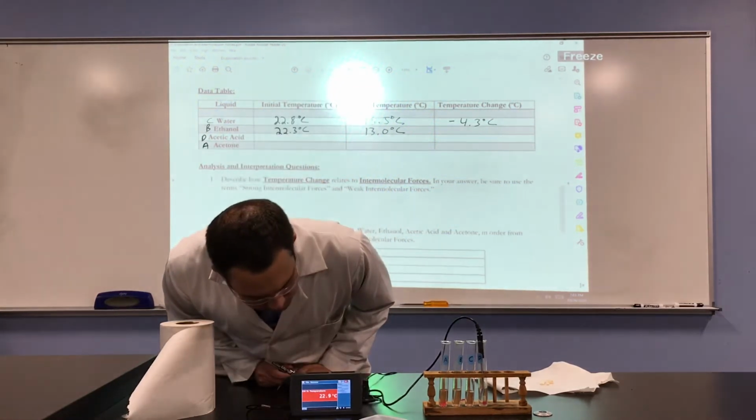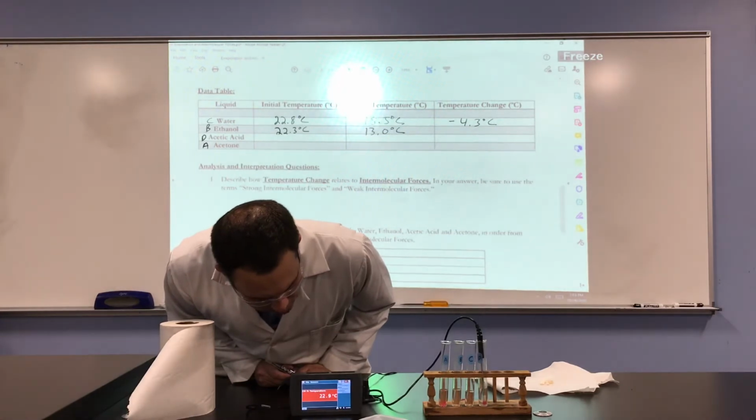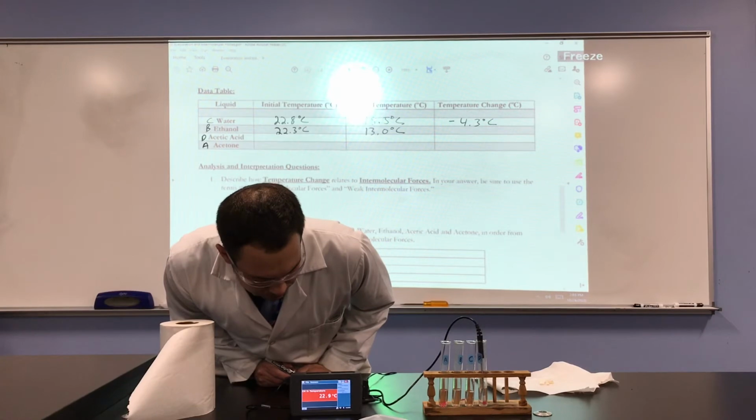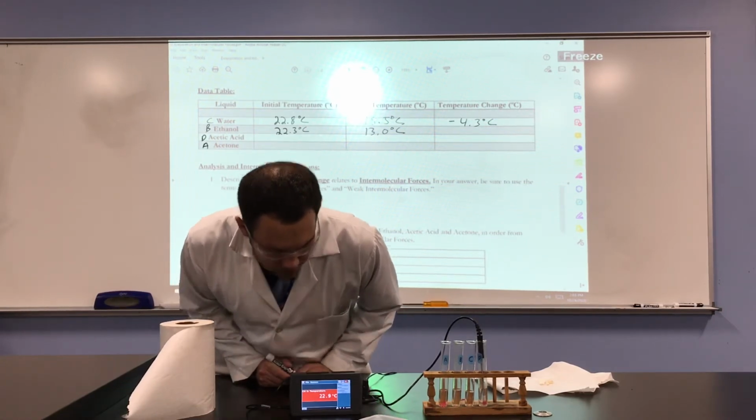That seems like a good place to start off with. 22.9. Let's see if it goes down one more tenth of a degree. All right, 22.9.